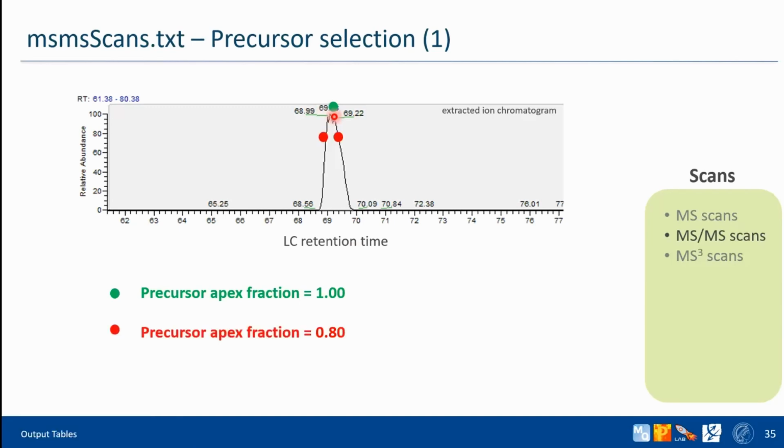But for example, you may want to have a wider window. But then you also go down with the success rate. Or you can also select a window that you want to discard completely. You know that after these 2 points, you don't identify anything. So you can remove the data from before and after if you're interested in that specific MS1 signal.